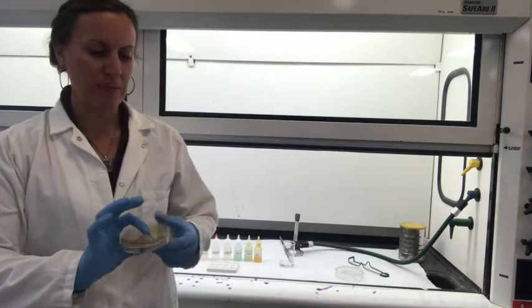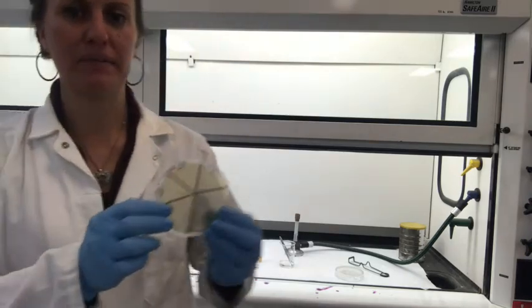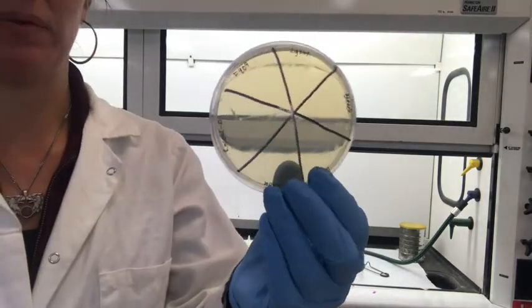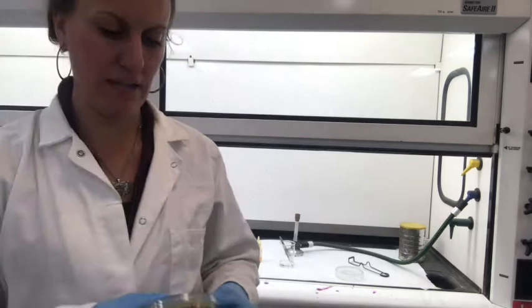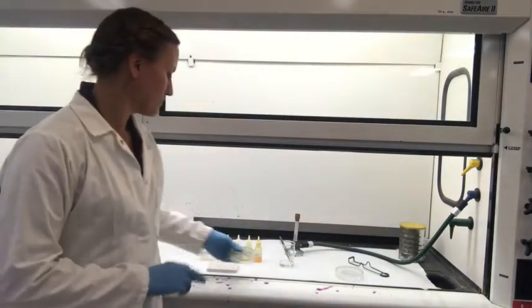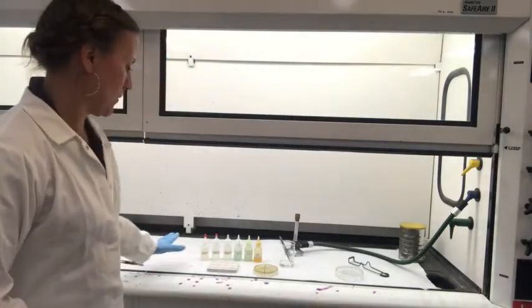In this exercise, we will start with a confluent lawn of bacteria, as you've already seen. For this one, we will be labeling the back of the TSA plate with each of the disinfectants that we will be using. So we have 6 different disinfectants. You'll see the list in the Canvas module. And you can see them here, so I have them in order.